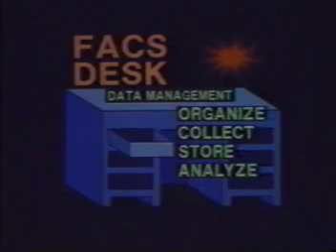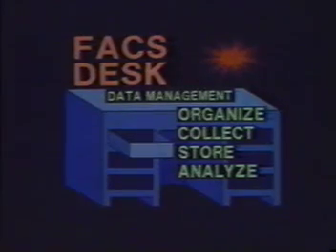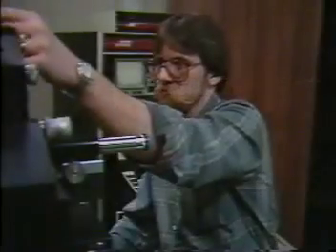The FACS Desk's data management system interfaces directly with FACS flow cytometry instruments. It works rapidly and efficiently to organize, collect, store, and analyze data for FACS experiments. This introduction to FACS Desk was videotaped at the Becton Dickinson Immunocytometry Systems Laboratories in Mountain View, California.